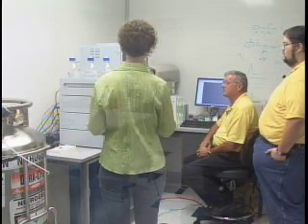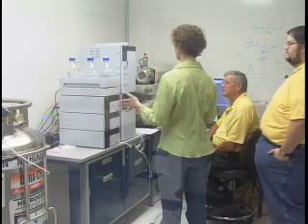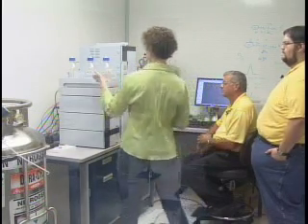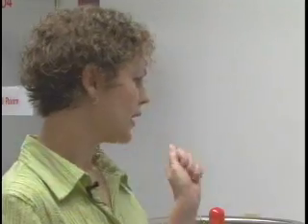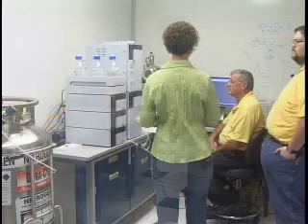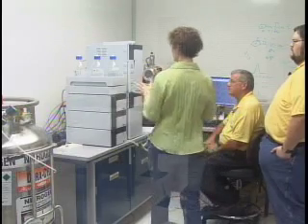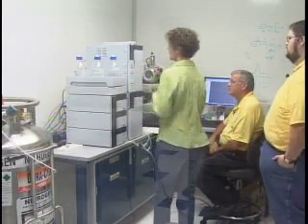This is the LC portion of the system, which includes an aqueous mobile phase consisting of ammonium formate and formic acid. The formic acid is important in the mobile phase because you want an acidic environment in order to enhance ion formation of your compounds. We've also got a second mobile phase, which is the organic mobile phase.